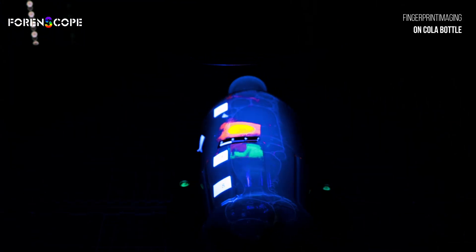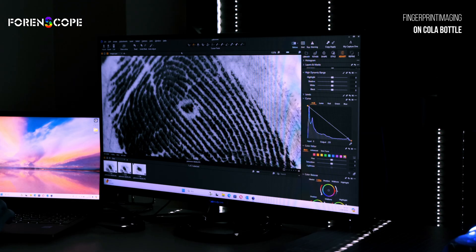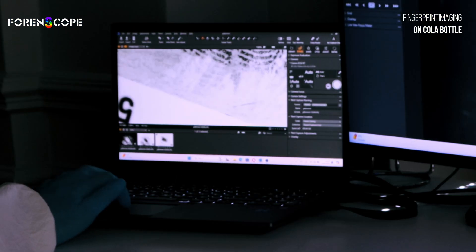The key lies in our innovative lighting and filtration system, designed to expose even the most elusive prints. Powder application brings out the details, ensuring nothing is missed.